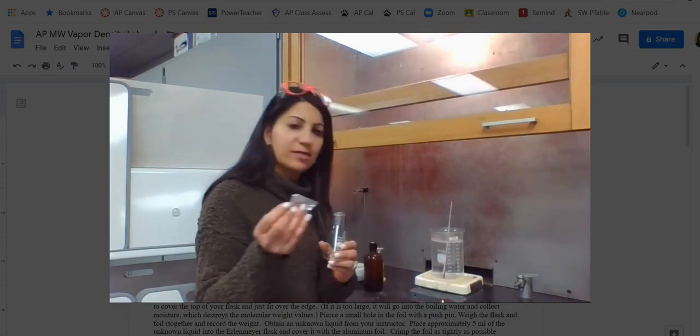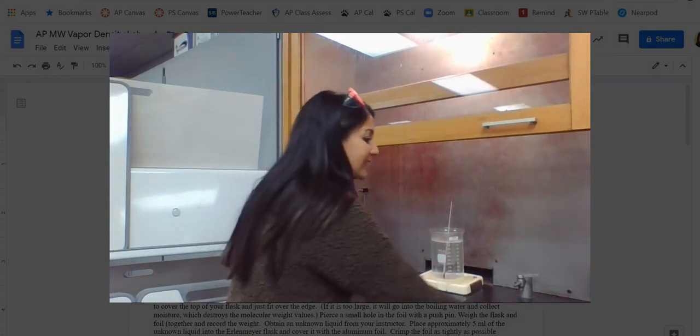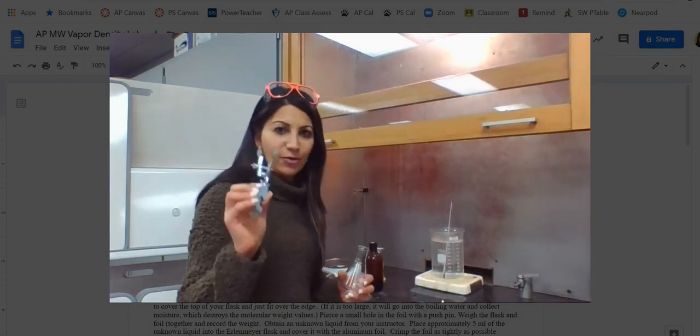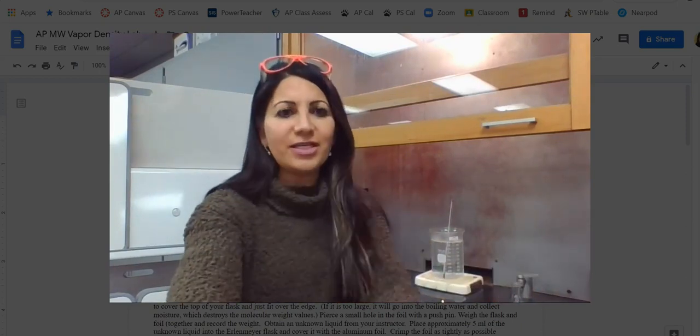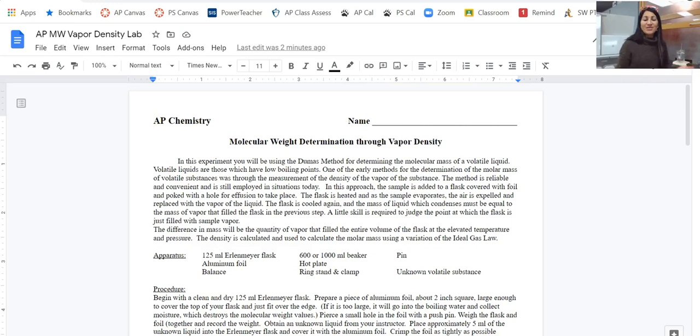I also have an Erlenmeyer flask. I'll talk a little bit about the foil and what I'm doing with that. And I have a burette clamp. And that's pretty much all we need. So let's just take a look at the... Okay, so the way that the Dumas method works, it just kind of explains here that we're going to use the idea of effusion where we put a tiny hole inside of this aluminum foil piece, literally just using a thumbtack.